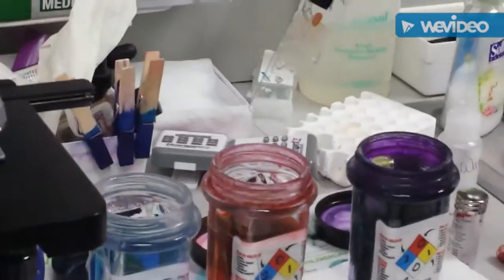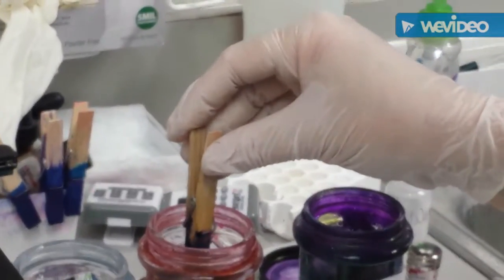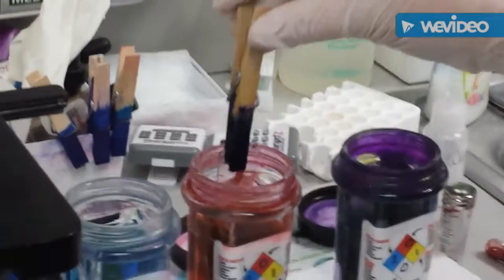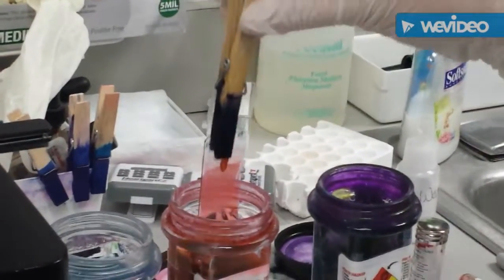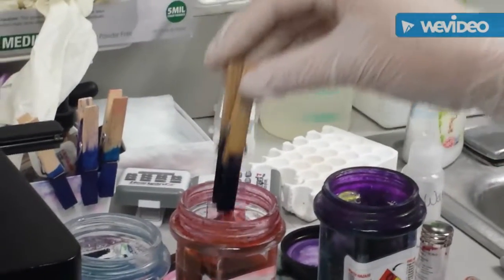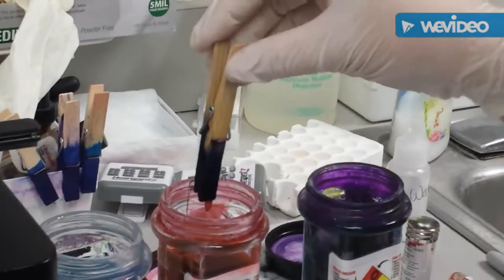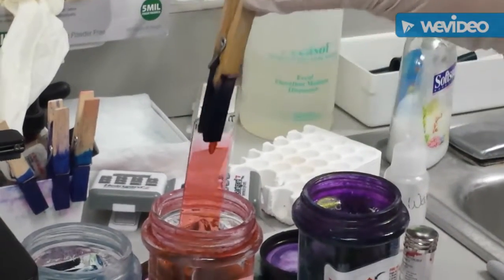Okay, so then we're going to move on to the dip quick stain, the second step here. And again, we're going to do 10 1-second dips. We want to make sure that we have a nice feathered edge because that's where we're going to read our slide. If the cells are too thick or on top of each other, you're not going to get a good reading.